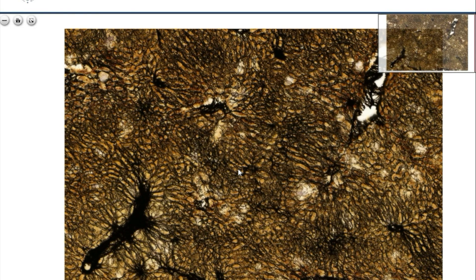Reticular fibers from the liver, stained with silver nitrate. The liver cells, which are epithelial cells, are encaged by reticular fibers.